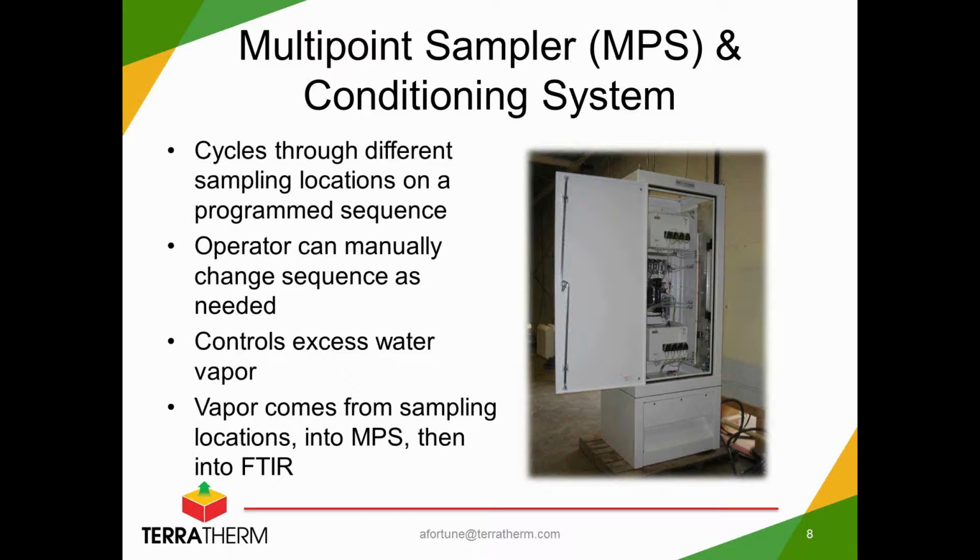Now, the FTIR is actually really well suited to monitor vapor at our remediation sites. It can handle hot vapors and wet vapors, and that's pretty much what we're dealing with most of the time at a thermal remediation site: hot, wet vapor.